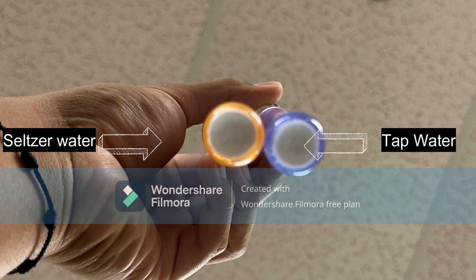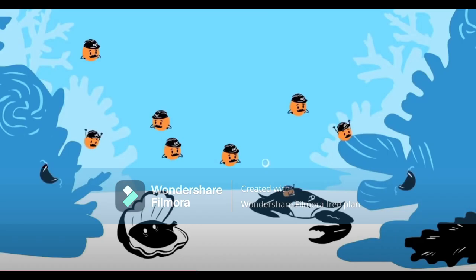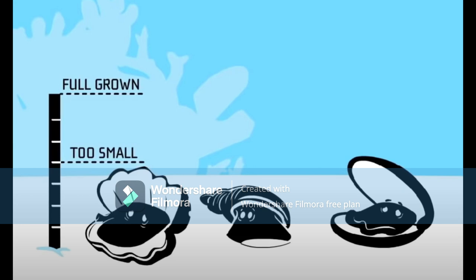In the other test tube, there is no calcium carbonate created since there is no carbon present in either the water or the calcium hydroxide. The powder just ends up sinking to the bottom. This process of lime water transforming into calcium carbonate affects the ecosystem because coral and shell animals use calcium carbonate as one of the building blocks of their outer structures. Since the shell animals will have to spend more of their time building their shell than looking for food, they will not be able to grow to full size, which in return will lead to smaller shell animals and lead to a smaller number of them.